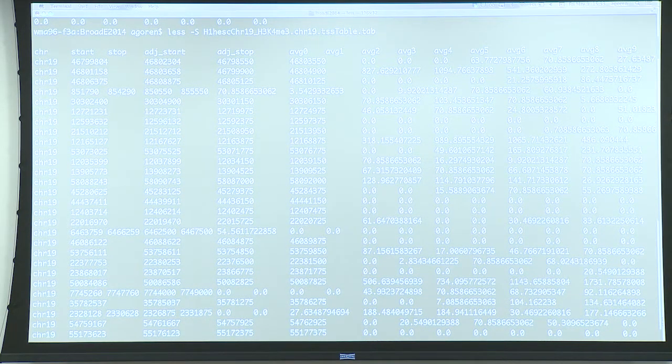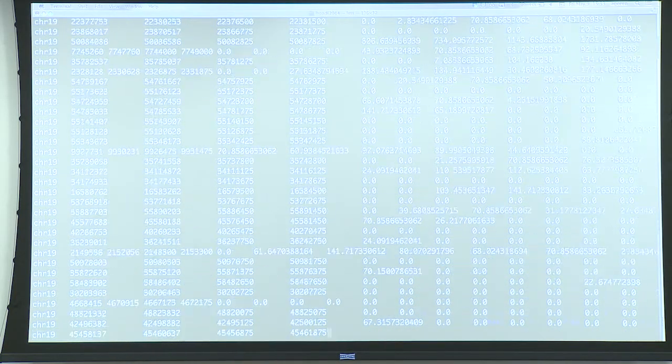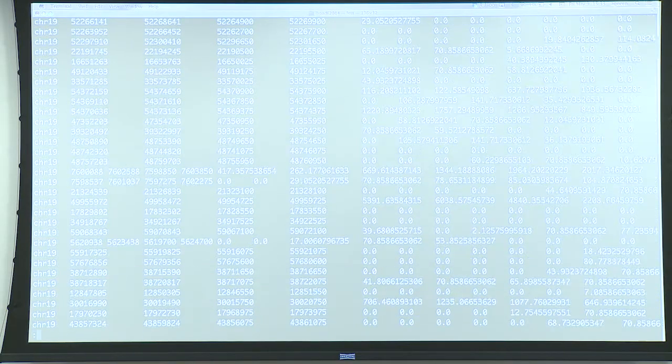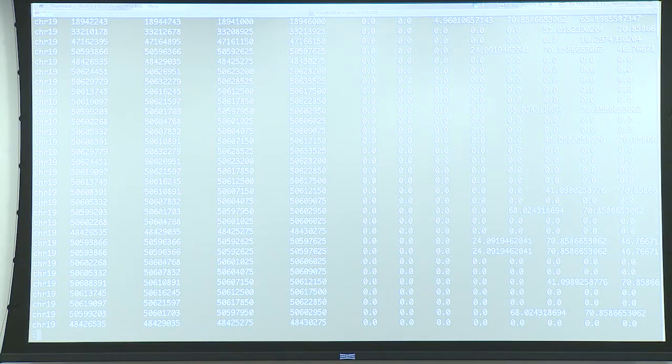it gives you the score of how many reads are falling there. So, for instance, in the first one there was almost nothing, and then you had 827, and then 70, and so on and so forth. And this is a big file, but for each chromosomal location that we gave it in the bed file, for each promoter, it's going to tell you how many reads were over there, or how many reads were touching the bins that we subtracted.